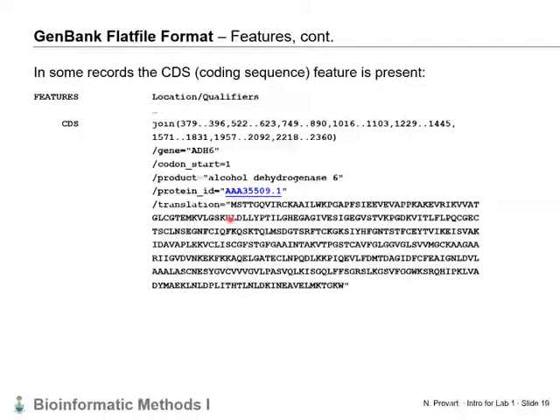So here in this case, we start with a methionine, there's a serine, followed by two threonines, and so on. Also in some records, you can see things like signal peptides or transmembrane regions defined. These computational predictions are very useful for follow-up protein work.